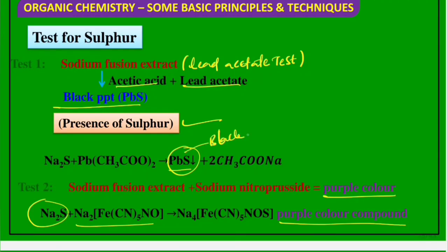It is a black precipitate. The black precipitate indicates the presence of sulfur.